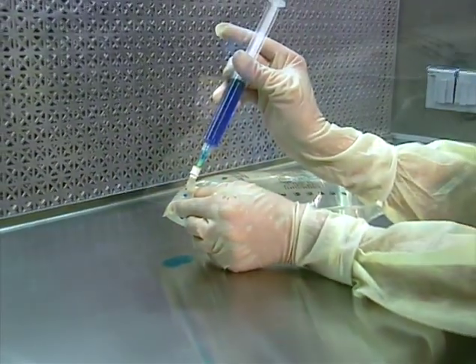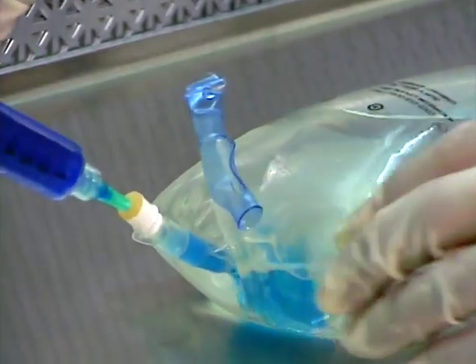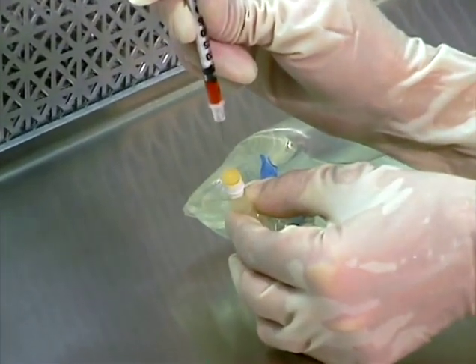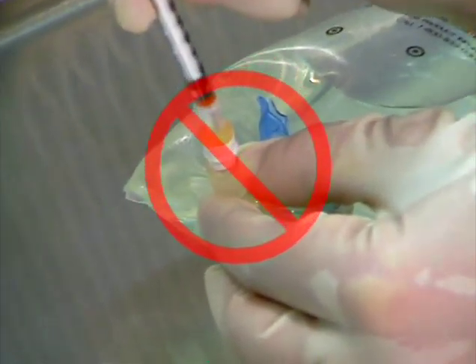The needle used to inject the bag must be long enough to puncture any inner seal in the tube portion of the additive port and pass through the tube into the bag so that the additives will mix effectively. Tuberculin or other short needles should not be used for injecting additives, because amounts of the drug may remain in the additive tube, preventing it from mixing with the diluent.